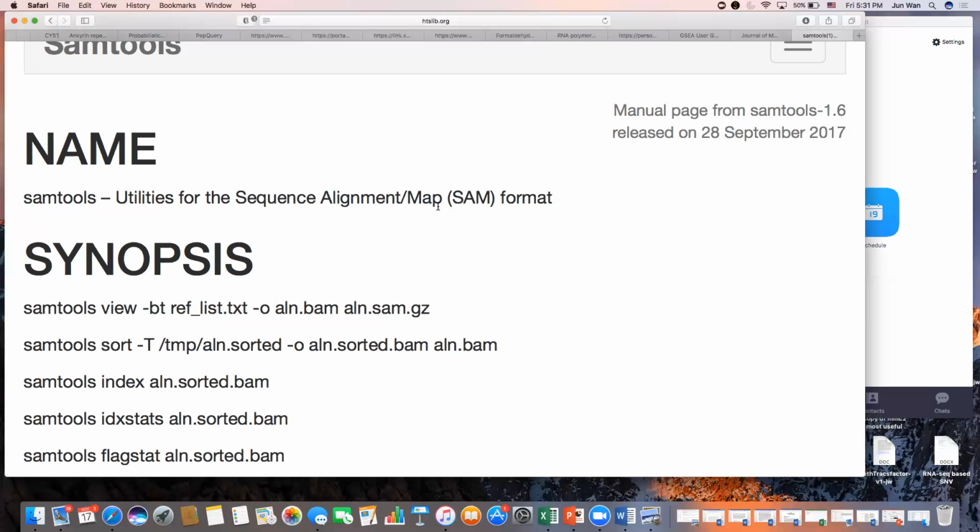You want to tell it that you want to do align.sam or control.sam. Then you put a greater than symbol, control.bam, enter. It'll convert SAM to BAM. So samtools view -bS control.sam, greater than symbol, control.bam. When I made them, it took 4 minutes to convert. Pretty quick.